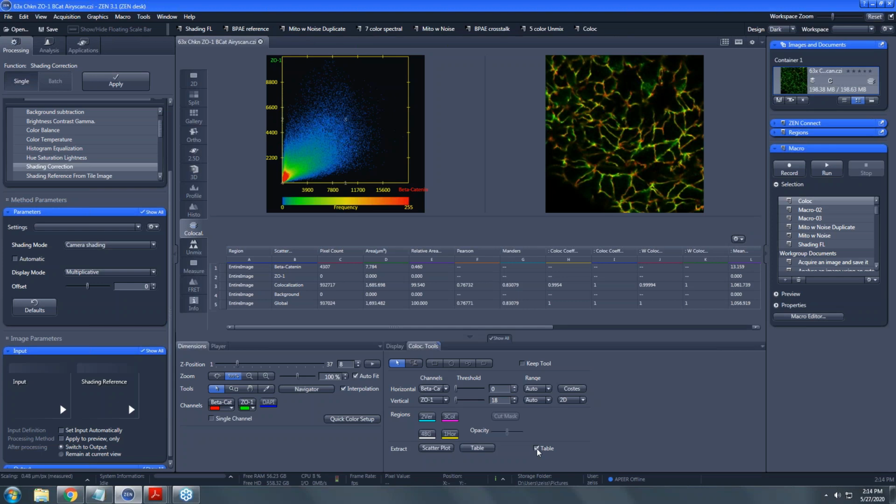If you imagine, not imagine, it's actually the case that all of these pixels have an intensity value both for green and for red. But if we do the imagining part and discard all the spatial data from our image, we just have an array of values where the green and the red are paired up, and we plot those on a scatter plot where the x-axis is one fluorophore and the y-axis is another.